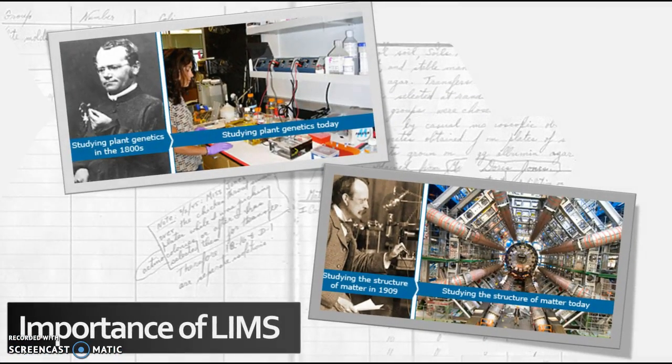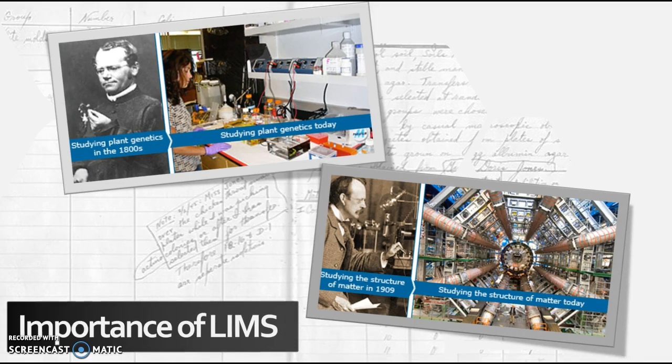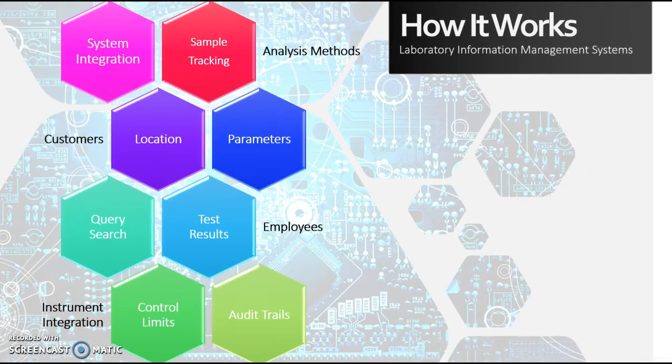In today's advanced and fast-paced world, working in a laboratory is very different from the practices that used to be carried out many years ago, which is why our information systems also require an update. Compared to the manual analysis and lab notebook practices, today the increase in production rate demands automated lab equipment with electronically stored data for quick retrieval. Since LIMS was developed, it has evolved from simple sample tracking software to an enterprise resource planning tool that manages multiple aspects of laboratory informatics.